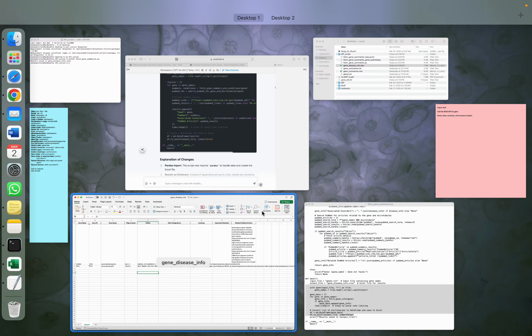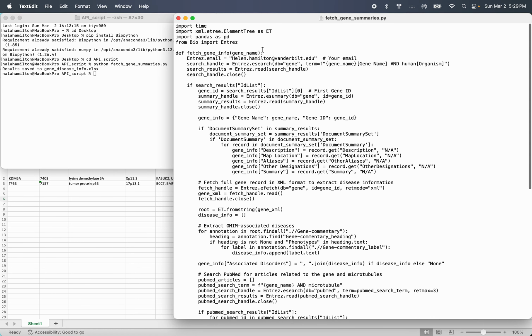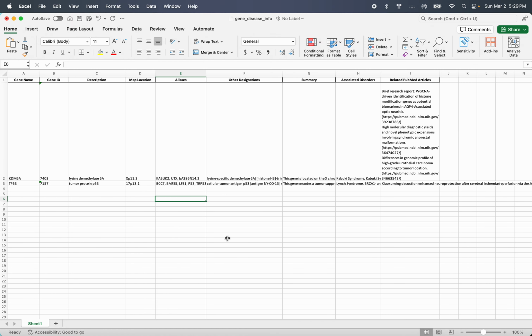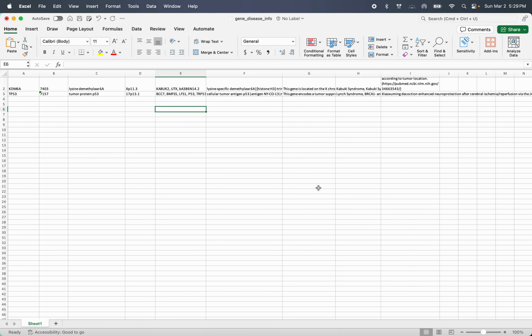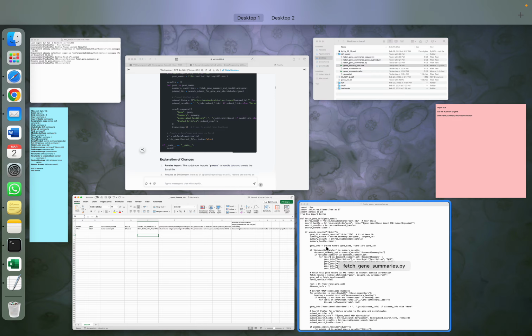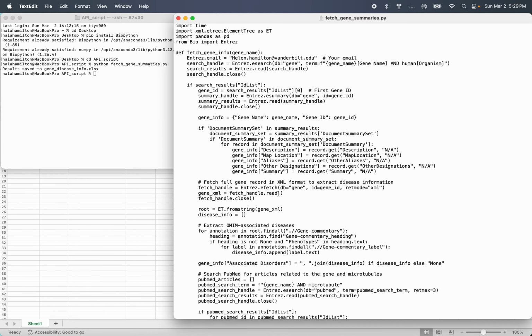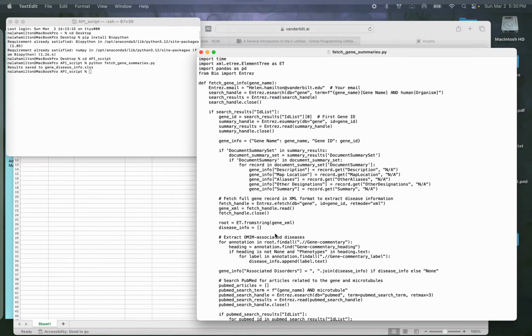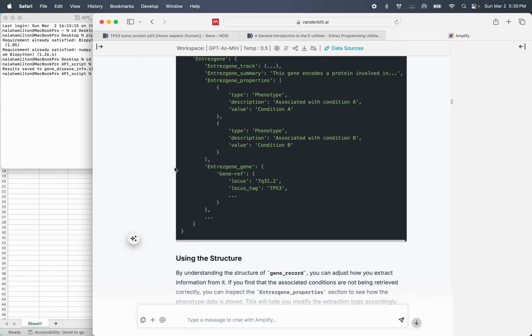And so in the future, I'm gonna save a list of those genes and then just run it through here, and hopefully I get a very succinct spreadsheet telling me the information that I actually want to know. So this is helpful so you don't have to do things over and over and over again, even though I did this code over and over and over again with chat.